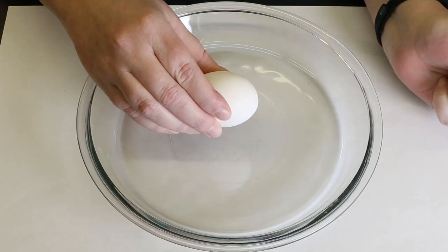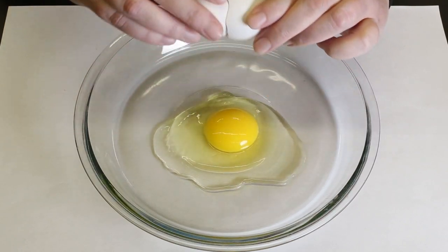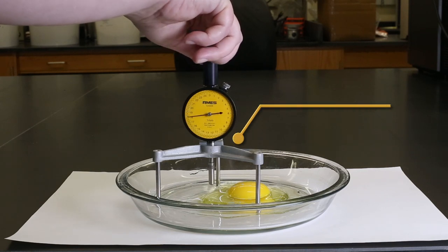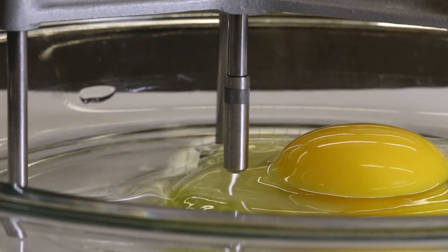The egg is tapped gently on a flat surface and broken into a flat bottom container. Pie plates work best because they are easy to clean. Allow the egg to settle into position before measuring. The height of the albumen, or egg white, is measured using a tripod micrometer. The probe is centered halfway between the yolk and the edge of the thick albumen, then slowly lowered until it barely touches the albumen.